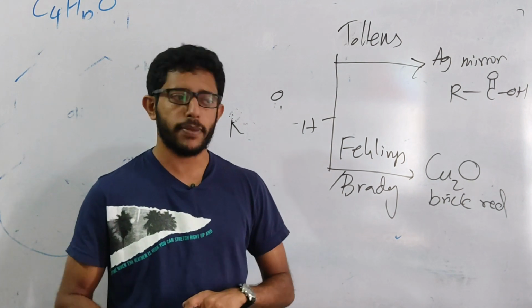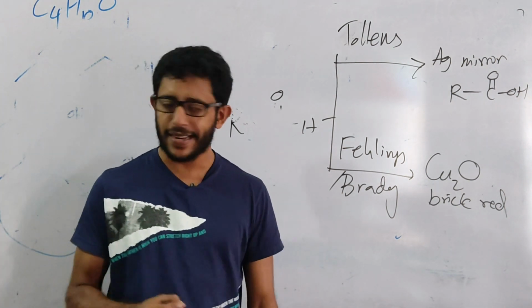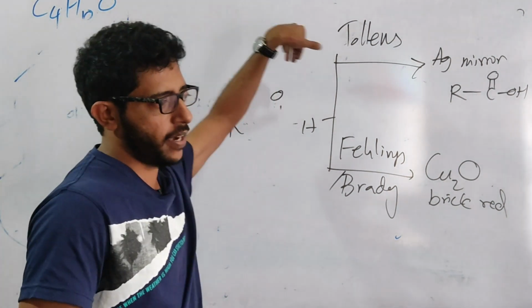and a few organic compounds, and I put a video of how we can identify them practically as well. So that's how we do the identification tests, right?